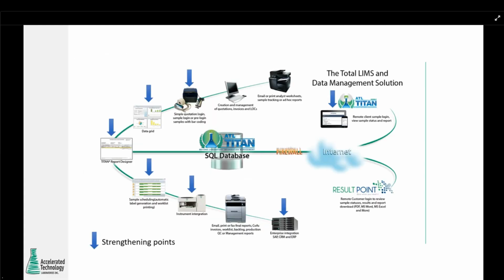Now, if we look at this slide, it's basically depicting a laboratory information management system along with all the components.